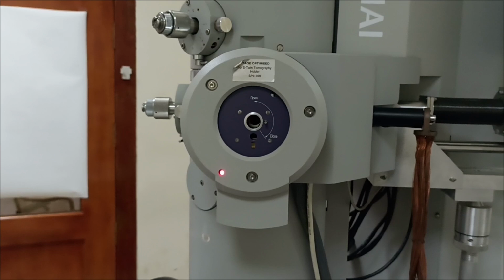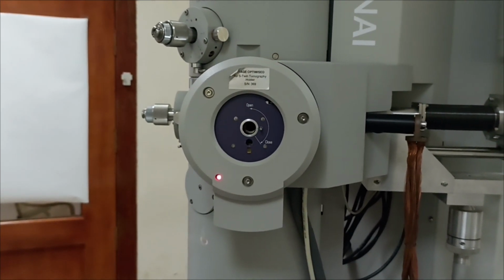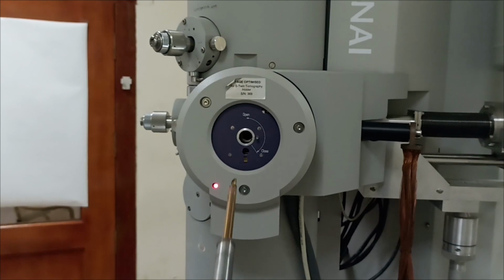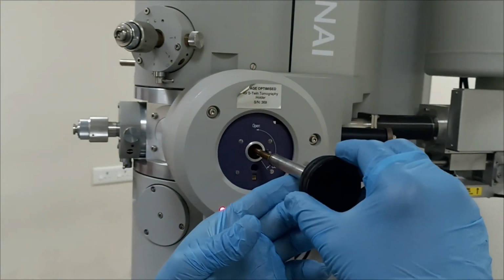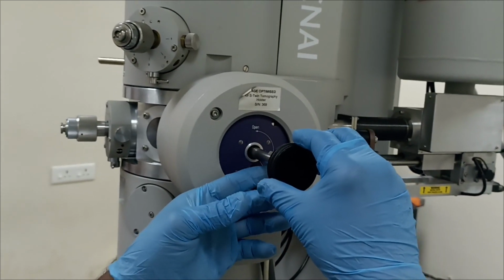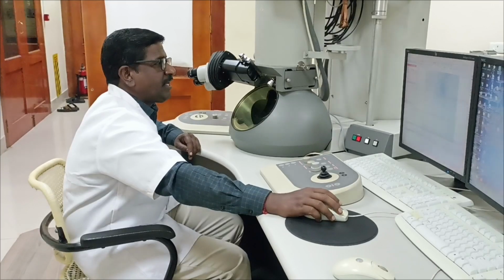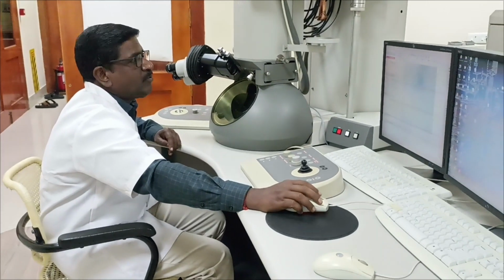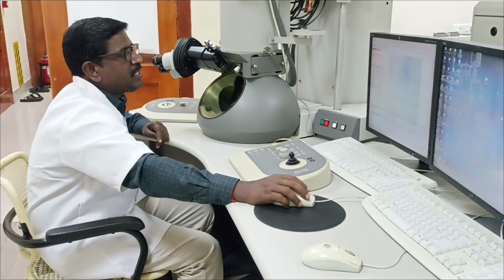After preparing the sample, we have to keep the sample in the sample arm. Then the sample arm has to be inserted like this through the goniometer, and the sample now will be fixed in the sample stage. After keeping the sample, we have to switch on the filament.